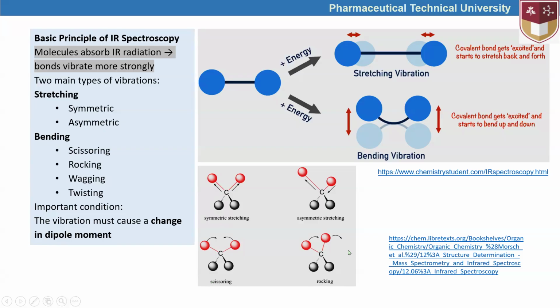So these are the pointers we have to understand, and stretching vibration has this kind of differences. These two atoms have this kind of distance, and while they are stretching from each other, the distance can be far. So that is how vibration is described, and this describes the bend.